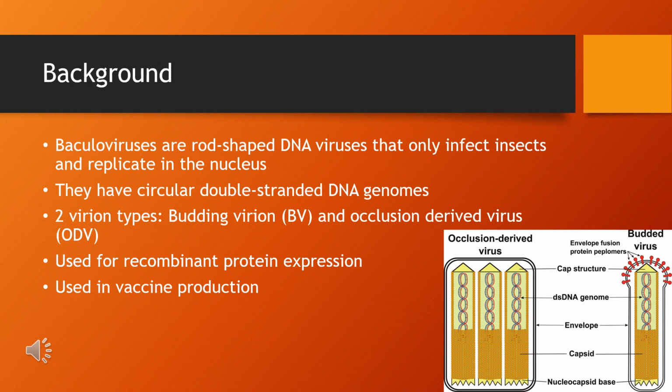Baculoviruses have been developed to be used for recombinant protein expression, and they are used in vaccine production.